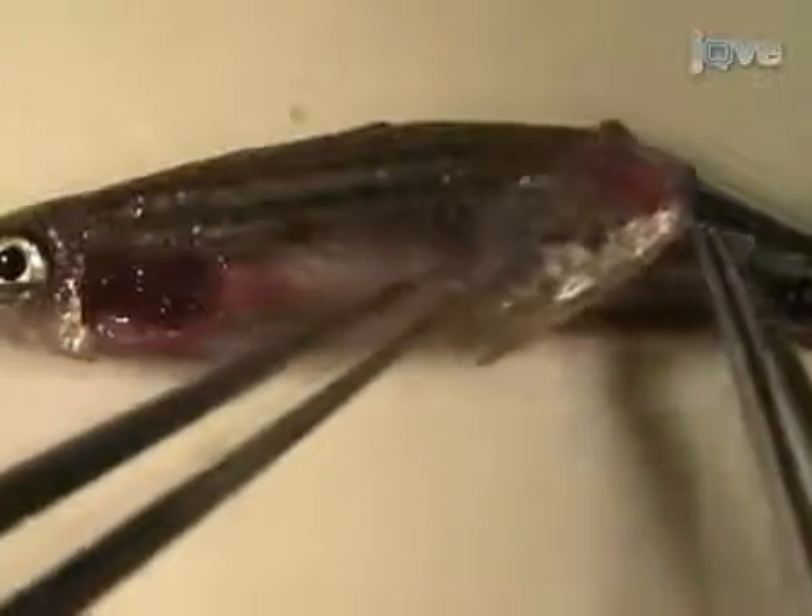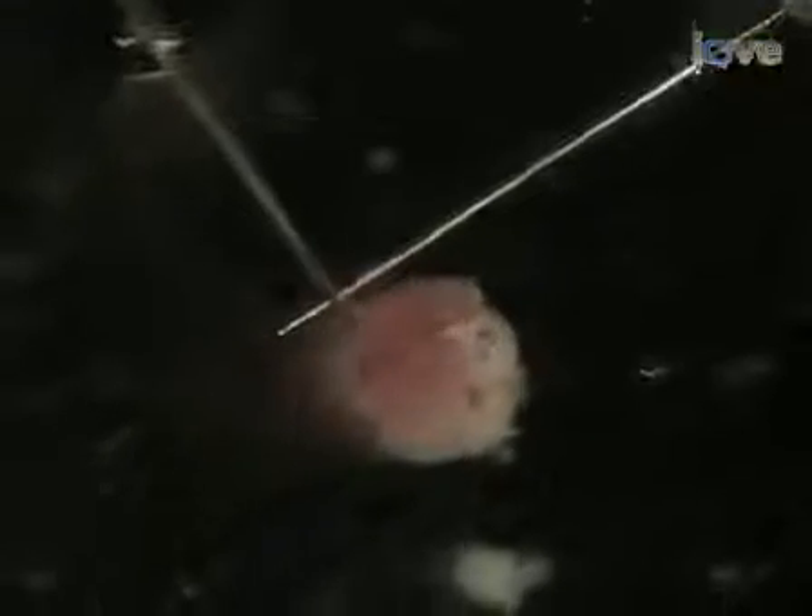Tripti Gupta from the Laboratory of Mary Mullins in the Cell and Developmental Biology Department at the University of Pennsylvania will identify many of the organs of the adult and demonstrate how to dissect them from an adult zebrafish.